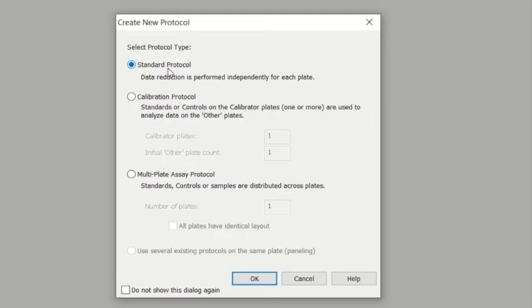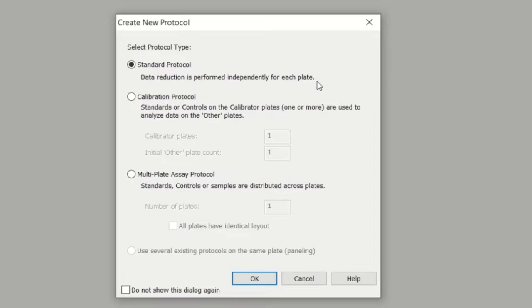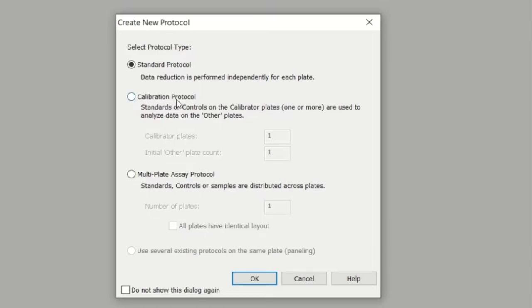It asks you to select the protocol type. You have three options. You can have a standard protocol where the data reduction is performed independently for each plate, so each plate will have different data reduction steps that are followed. You can also have a calibration protocol, which allows you to have standards on a particular plate be used to analyze data on another plate.